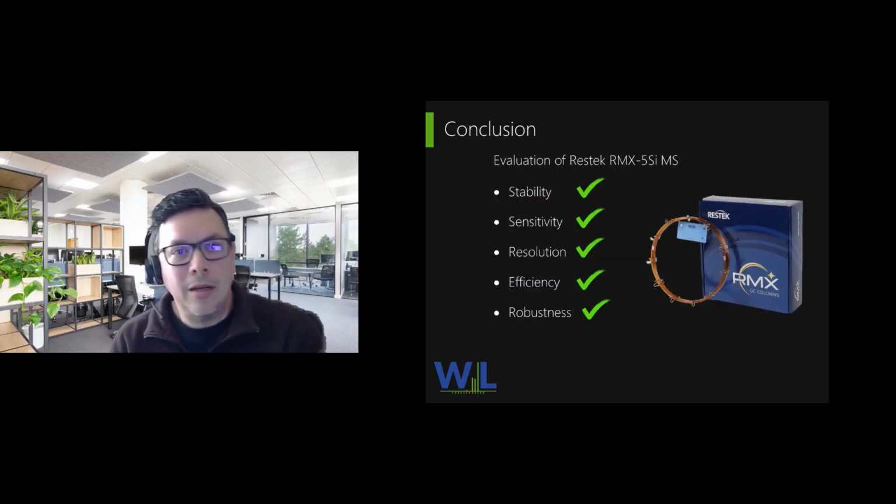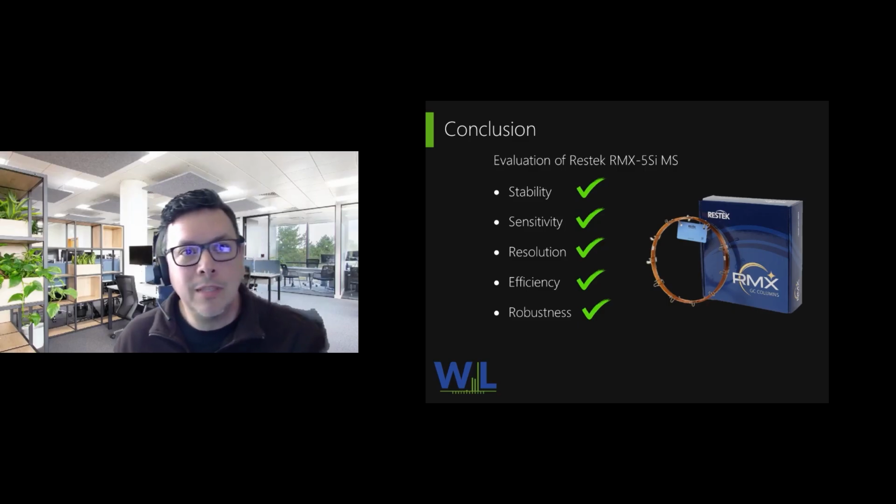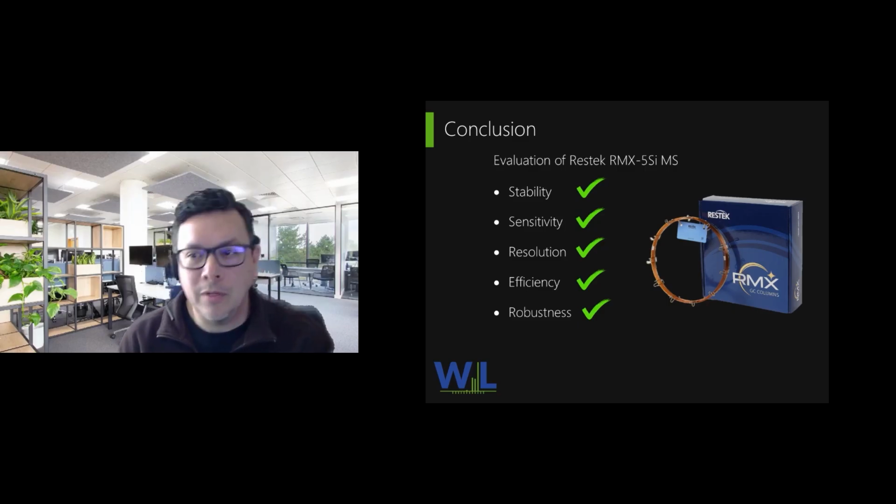So in conclusion, I tested this column through several tests: stability, sensitivity, resolution, and efficiency. In terms of stability, this column was super stable. It's still being stable. It's very reproducible. And the thermal bleed was non-existent. It's pretty much not there. It's not going to affect your runs. So it's a green light.